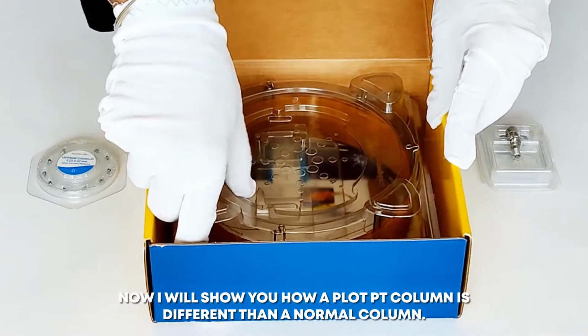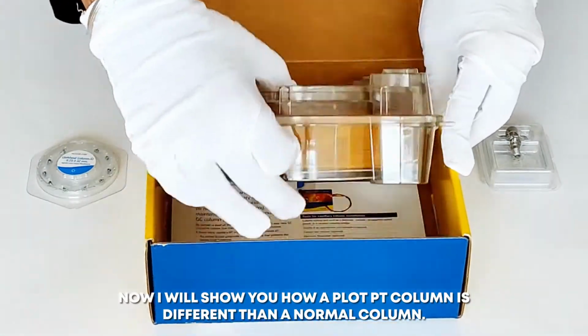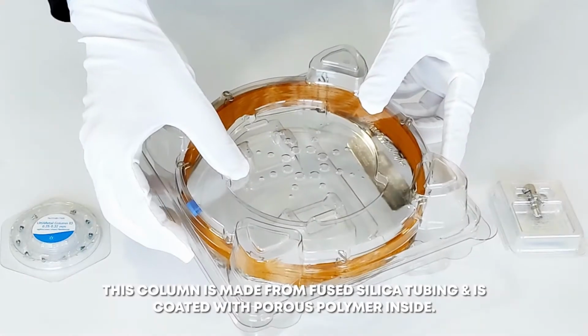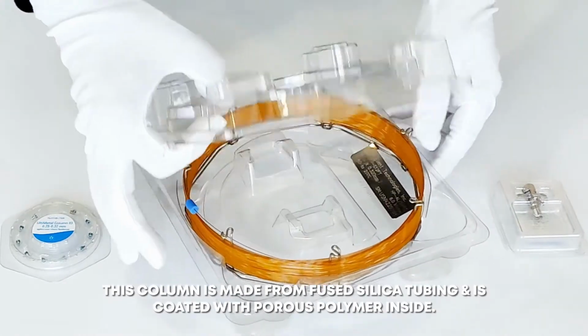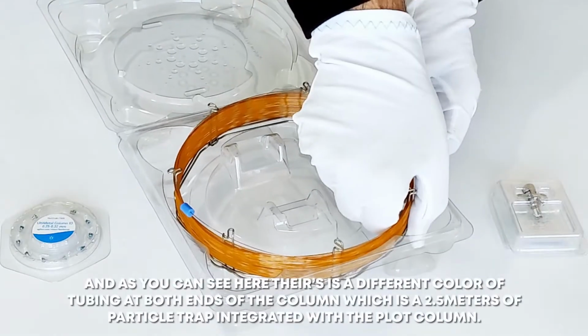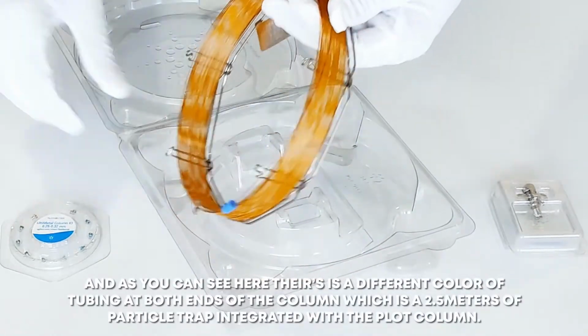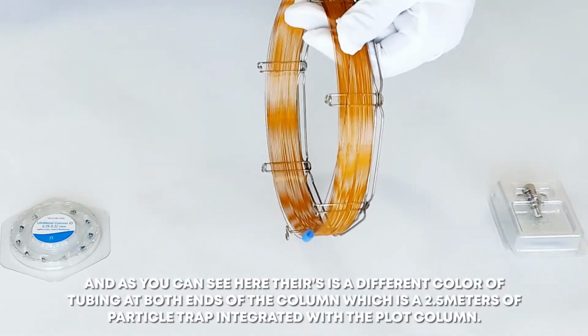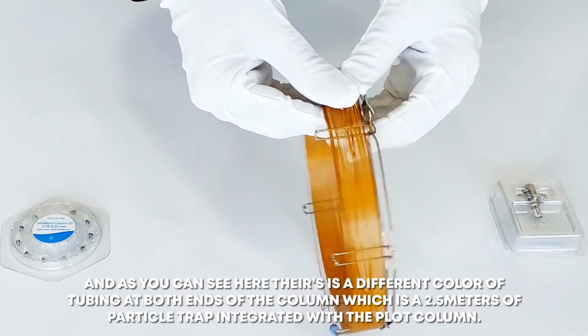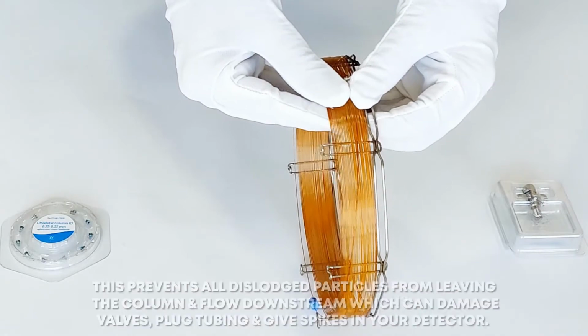Now I will show you how a plot-PT column is different than a normal column. This column is made from fused silica tubing and is coated with porous polymer inside. And as you can see here, there is a different color of tubing at both ends of the column, which is 2.5 meters of particle trap integrated with the plot column.